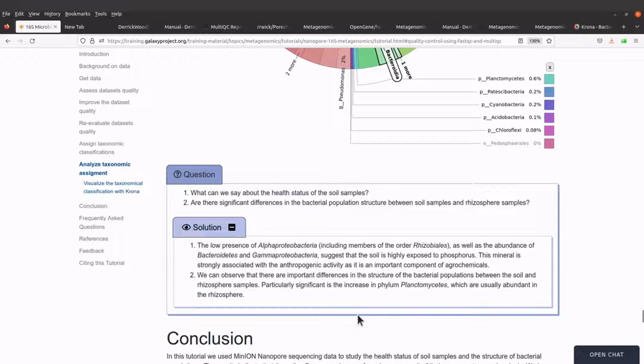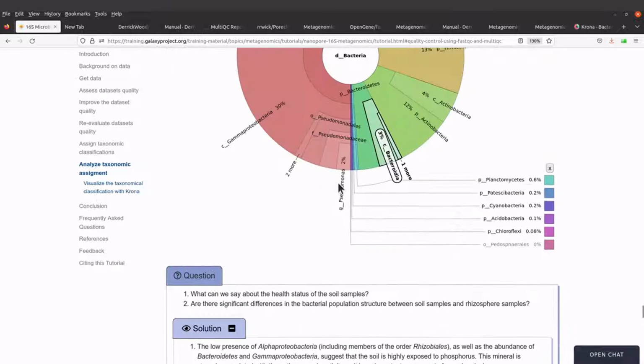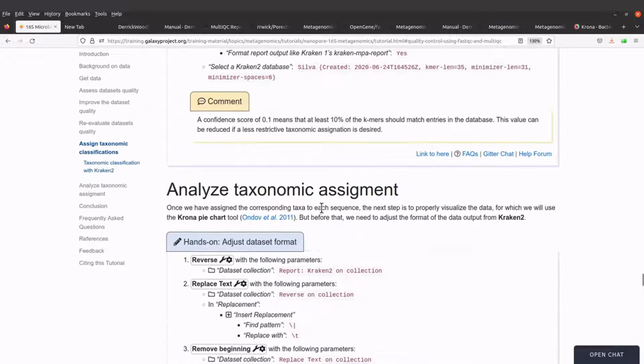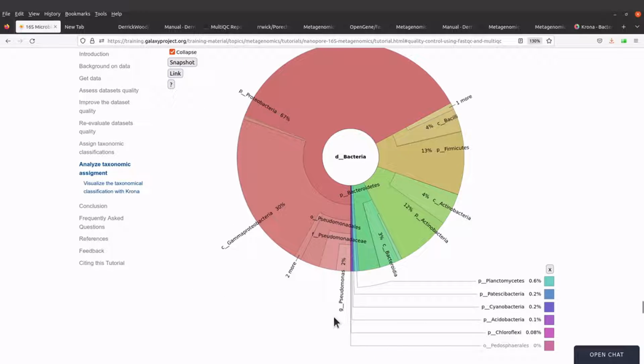So in this video, you have been able to analyze 16S metagenomic data, which is a very good experience for you. I will encourage you to also read the notes that have been given on this particular page. It will help you to better understand the 16S metagenomics data analysis workflow. So try and read the notes here, and you'll be fine.